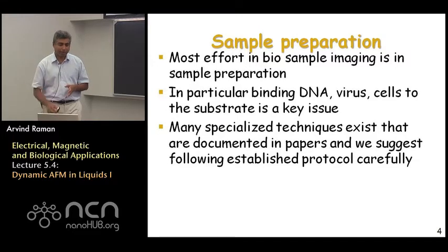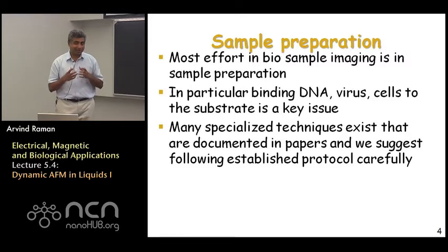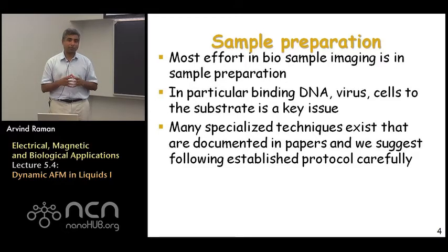In particular, sample preparation requires a very good understanding of surface functionalization and surface forces to ensure that your biological sample remains adhered to the substrate and doesn't float up when immersed in liquid. There are many specialized techniques that have been developed for trying to immobilize biological samples on surfaces. I encourage you, if you haven't tried atomic force microscopy in liquids, that paying a lot of detailed attention to sample preparation protocols is essential for liquid environment AFM.